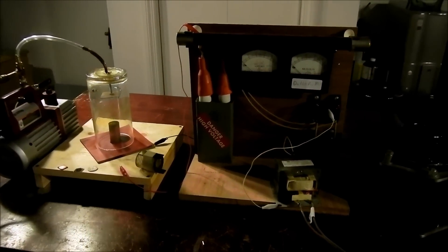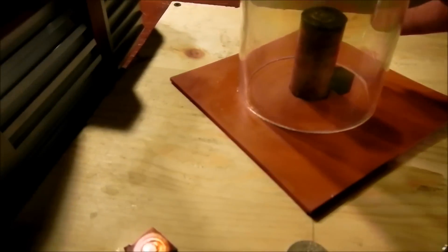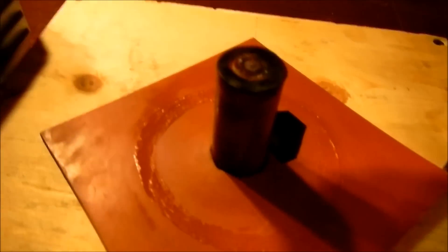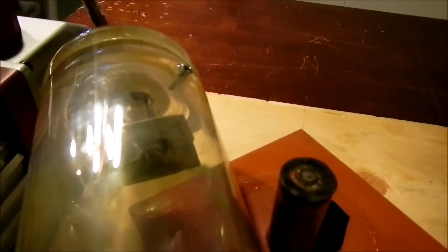Welcome to another one of my magnetron sputtering videos. I made some various improvements on the design. I've eliminated the water cooling system — I get comments on that, but I no longer need water cooling. The magnets are contained in this copper tube, and hopefully I'll publish some designs about this later.